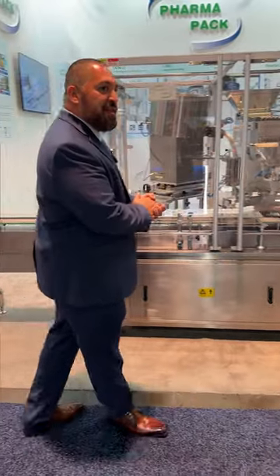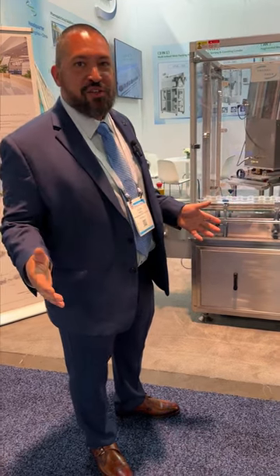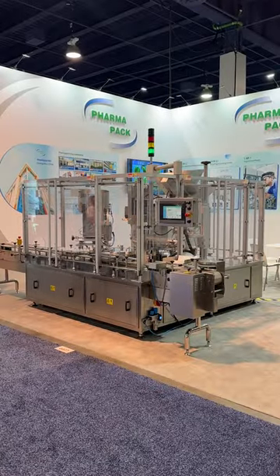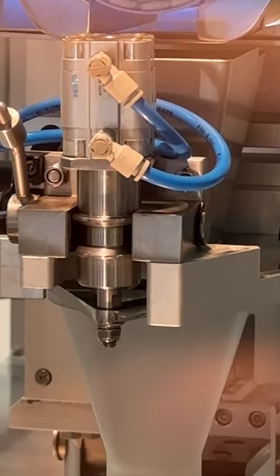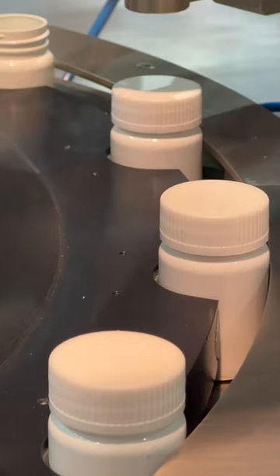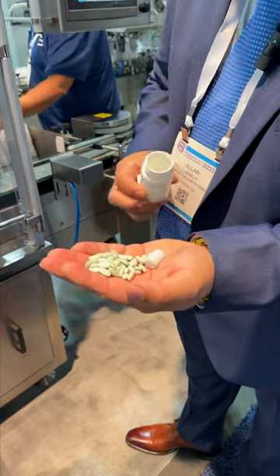Basically, this is for people that don't have a lot of space and have some space restrictions. This fits in a 10 by 10 space and it actually puts your product in the bottles with desiccant and caps your product. This is the end product — your tablets with your desiccant.